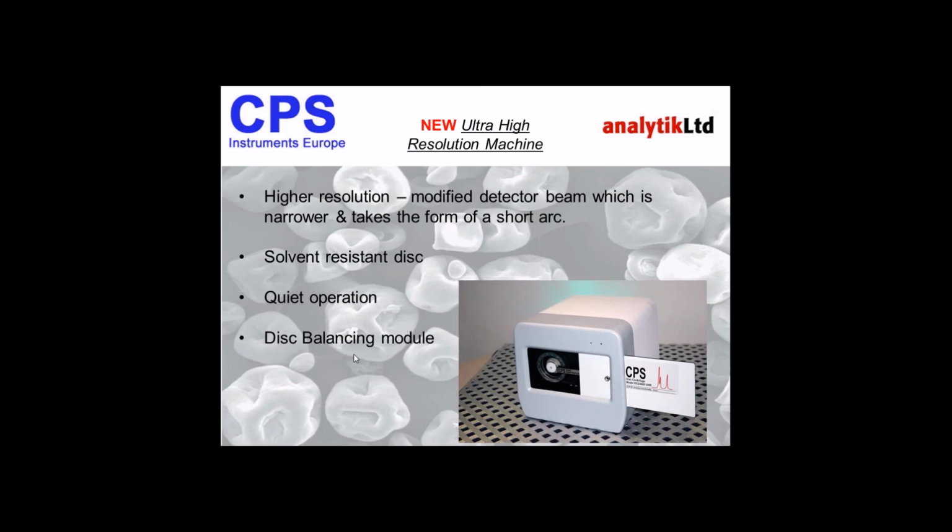What this does is ensure the instrument's longevity by recording the unbalance and warning if the disc is outside its set specification. So this module is continuously measuring the disc imbalance, and it identifies which disc hole on the disc needs weight to be added and how many milligrams of weight to be added. So this means that over time, if your disc does become unbalanced, you can correct for this yourself.